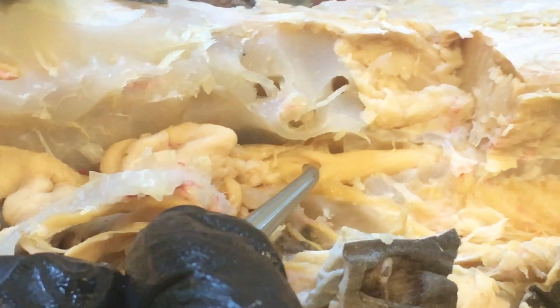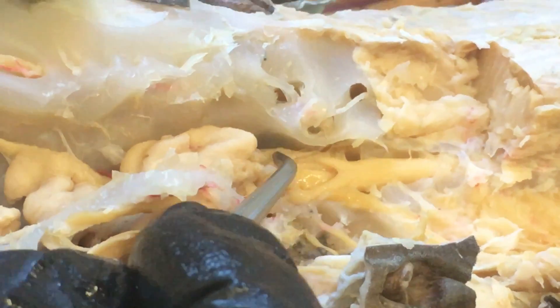Somatic motor columns are here. These are the somatic sensory — these ridges on the side. And just below that ridge on the side, you can see another ridge, and that is the visceral sensory.